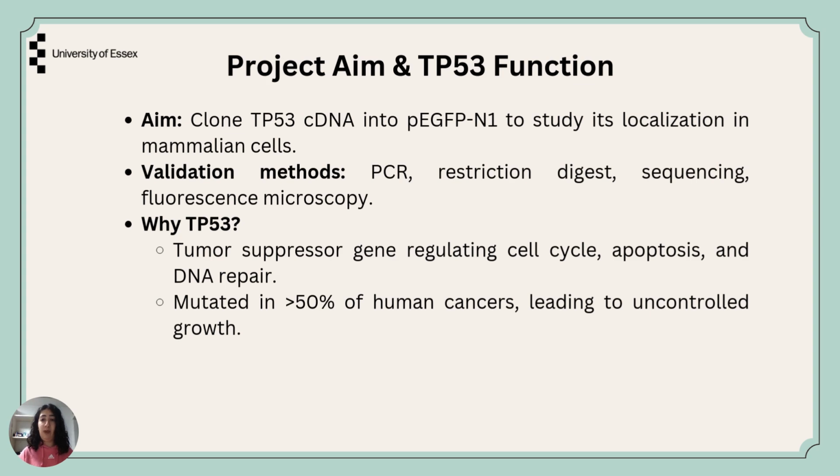So, the aim of this project is to clone TP53 into pEGFP-N1, a mammalian expression vector, and validate its expression in cells. This allows us to track TP53 localization via GFP fluorescence.